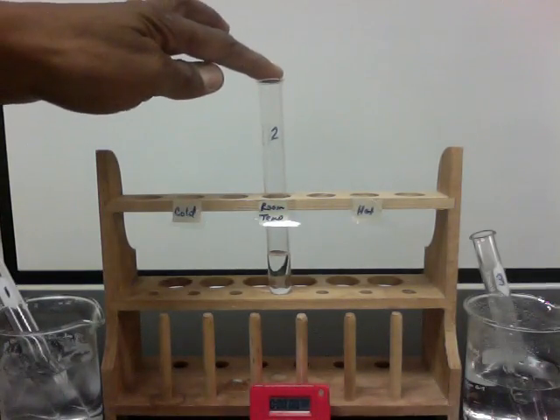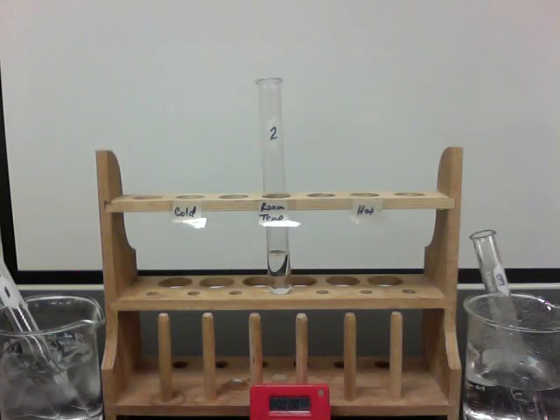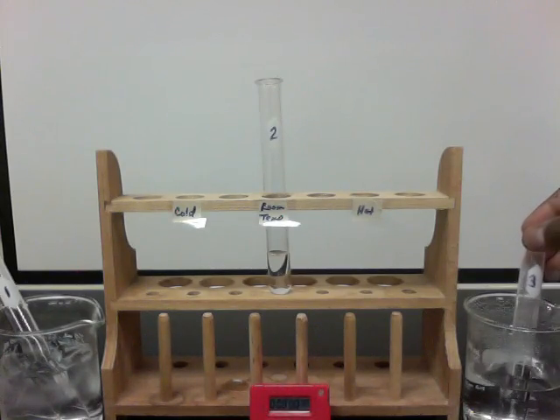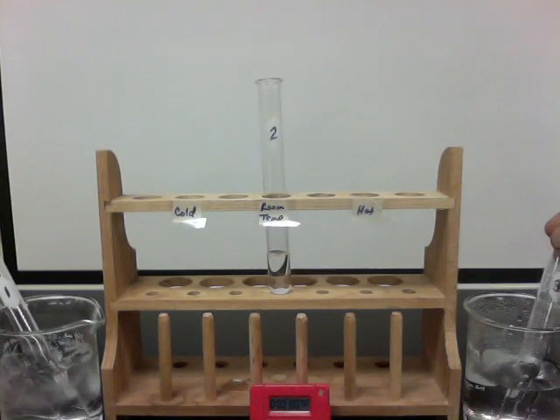This is test tube 2. It also has 5 milliliters of 10% hydrochloric acid, but it's at room temperature. The third test tube is over here. It's sitting in a beaker of hot water, and it's been in for about 5 minutes as well. And it too has 5 milliliters of a 10% solution of hydrochloric acid.